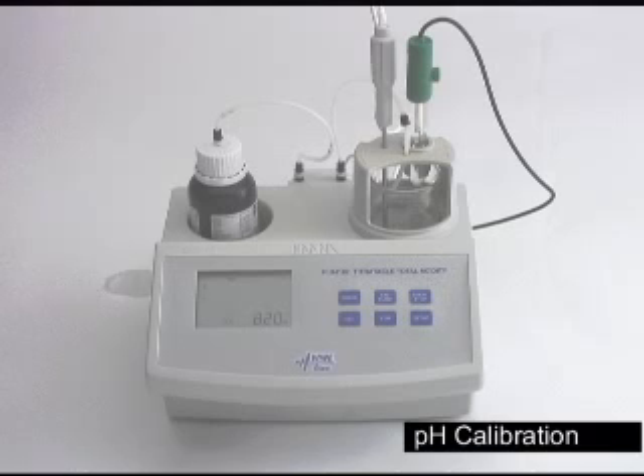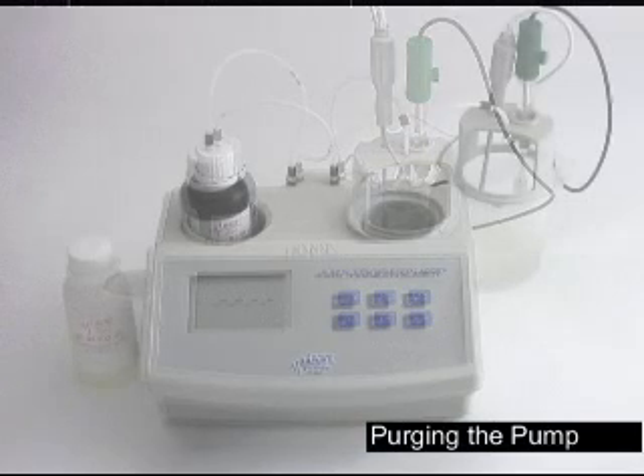It'll blink cal and tell you what standard you should have in there, then hit the start-stop button. The machine for 15 to 30 seconds will stir and take a reading. When it's done, it'll blink and put three more marks across the screen. We are now done with the pH calibration.